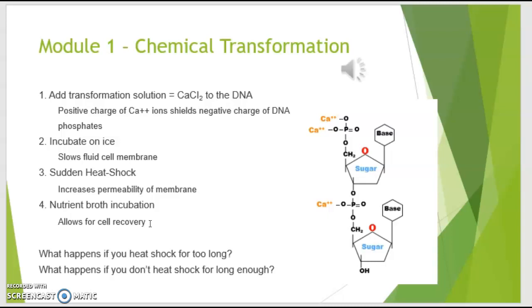The questions at the bottom say, what happens if you heat shock for too long? What happens whenever you put bacteria in any sort of heat for too long? Hopefully you should know that the bacteria will die. What happens if you don't heat shock for long enough? If you do not go through the heat shock for long enough, then the cell membrane will not have increased movement and will not open, and the DNA will not be able to enter the cell. And so you will not perform chemical transformation because the DNA plasmid is not able to enter the cell.